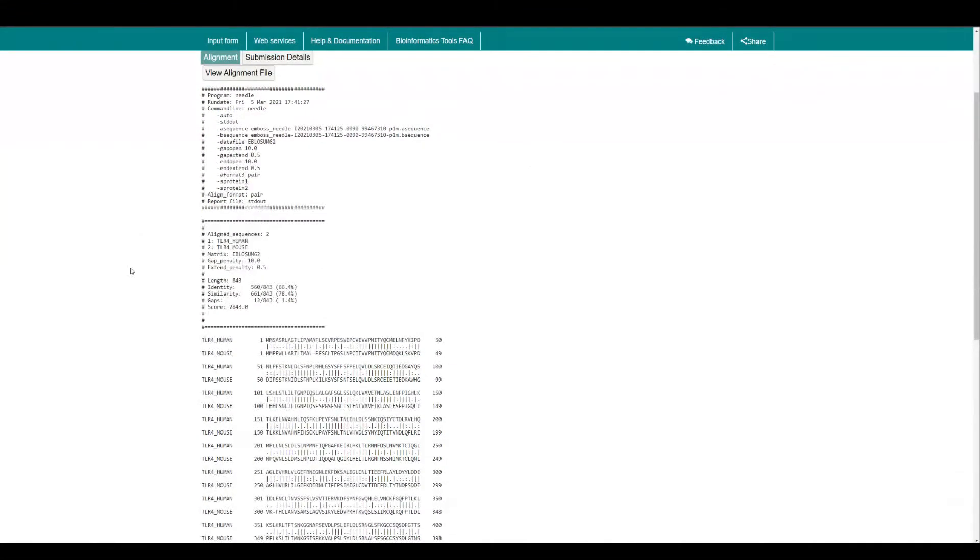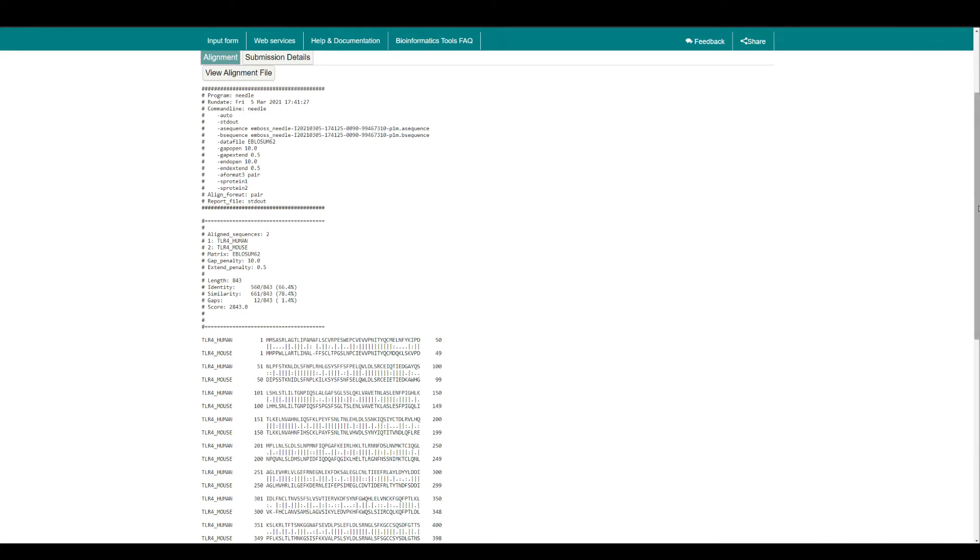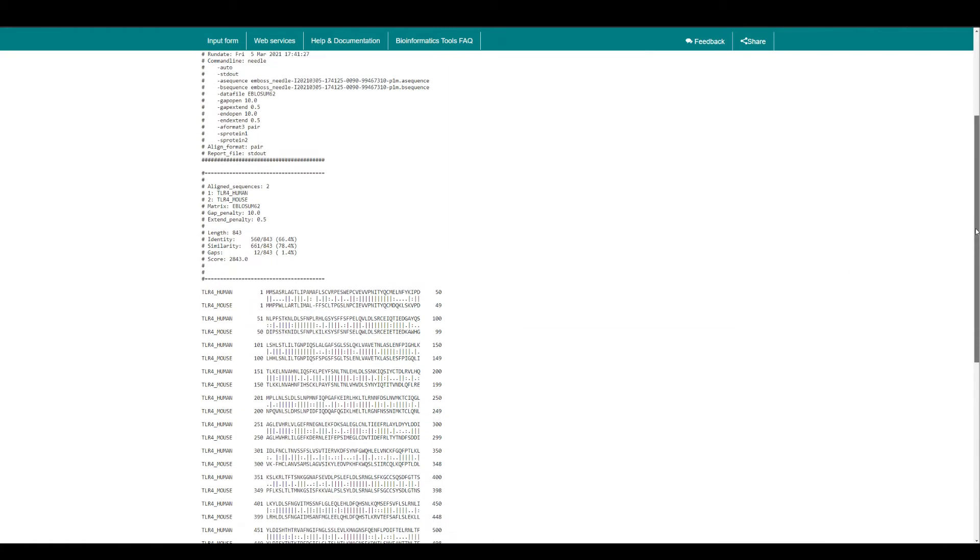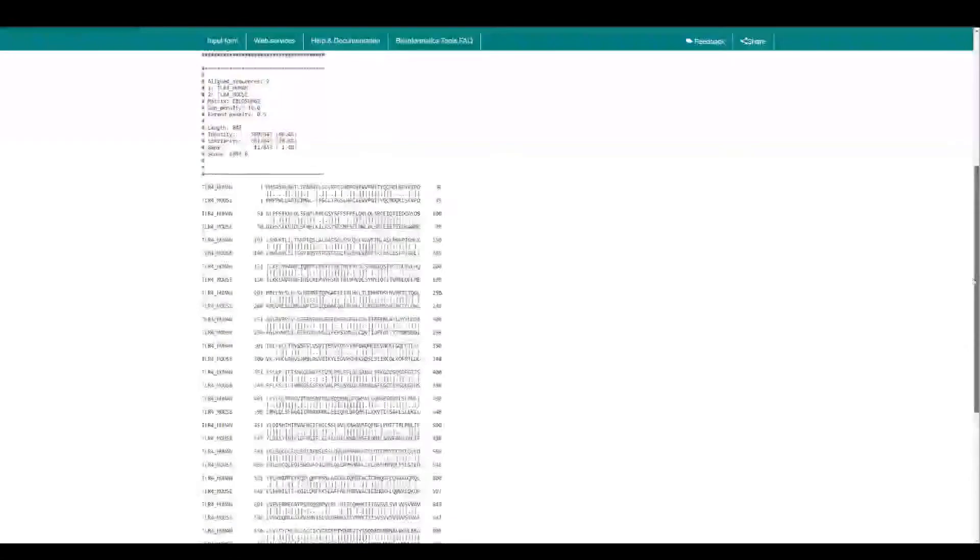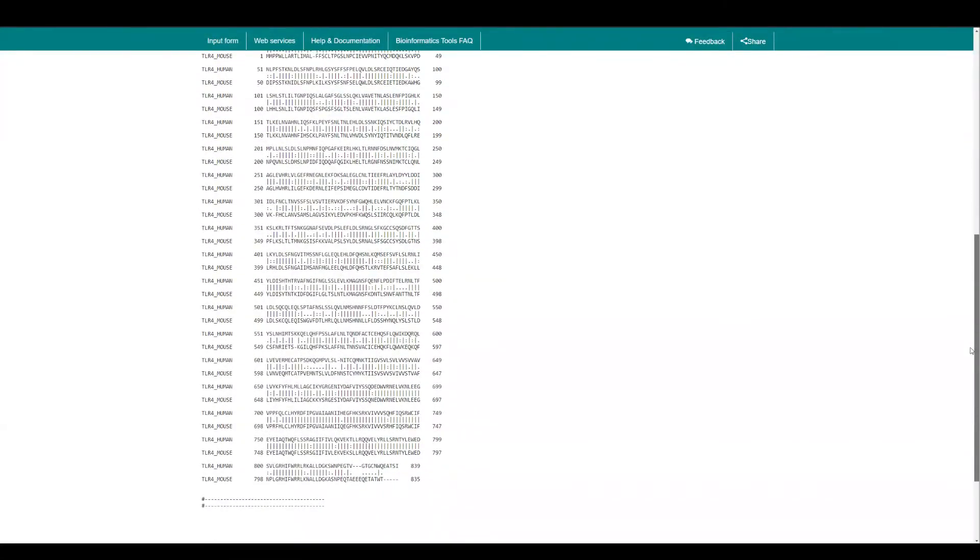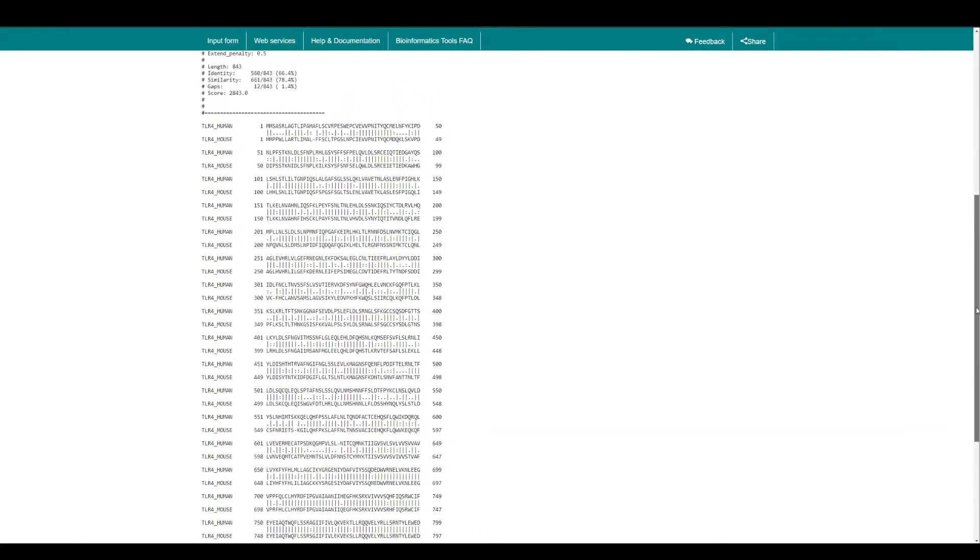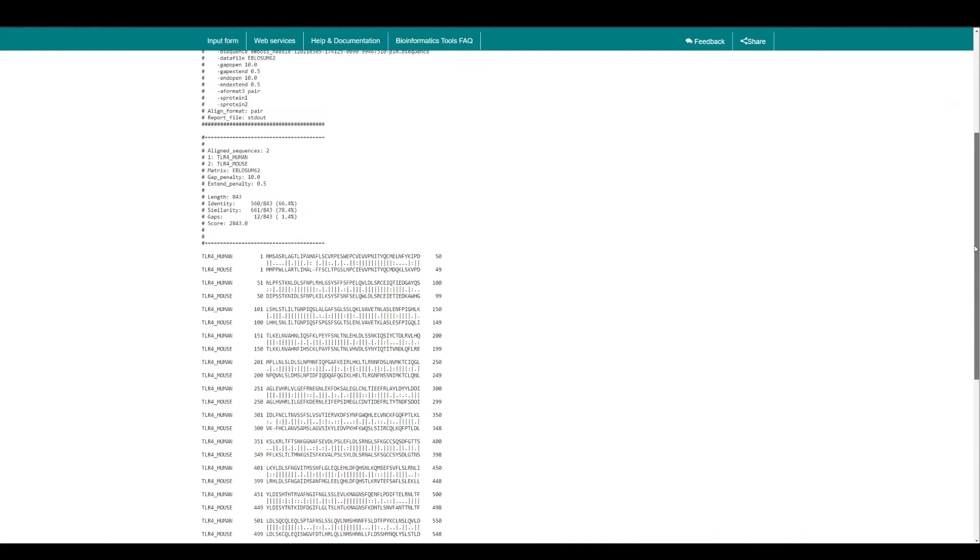This is some of the values it provides you that's important because it's going to tell you percentage identity. Look, 66.4% similarity, 78.4%, and then you have some gaps. Total score is very high because they both are toll-like receptors and you're not expecting too many differences, but still you can see there are significant differences here.